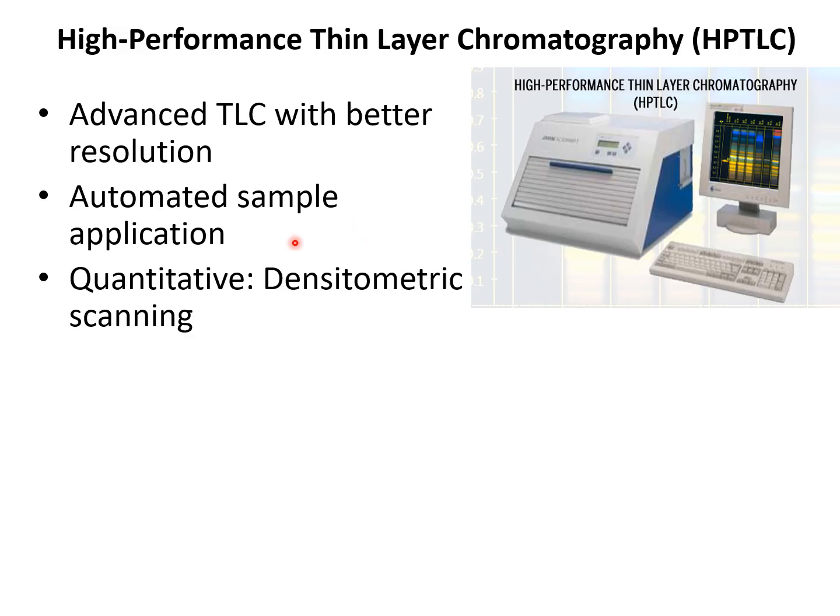After development, the analyte in the samples are detected and quantified using an instrument called TLC scanner. The TLC scanner has the ability to scan the TLC plate at various wavelengths and quantitate the spot on the TLC plate.